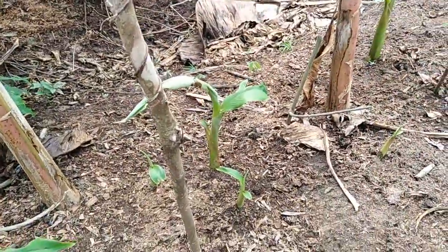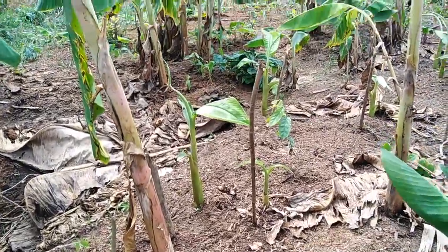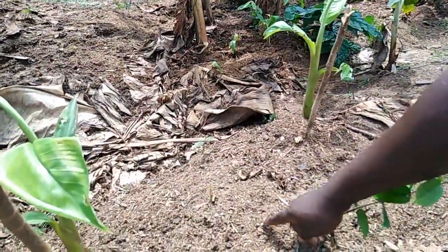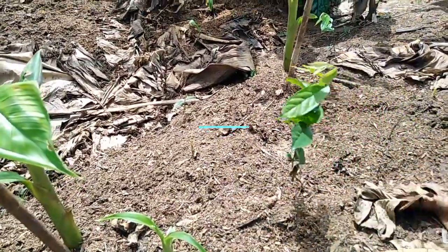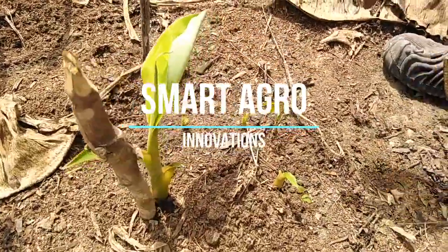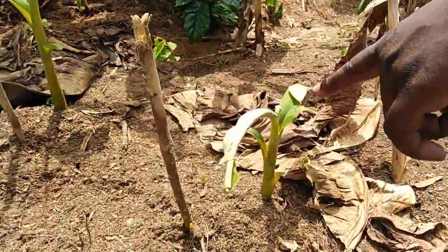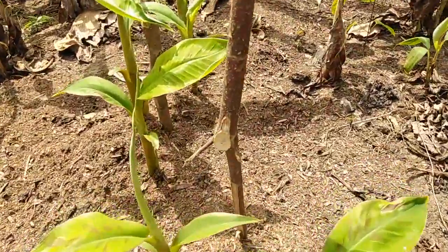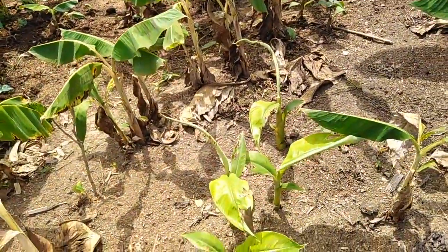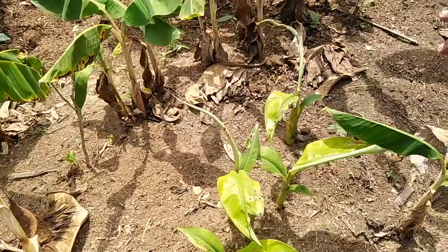Here too we have three, and still counting. This one still has only one seedling coming up. You have two here. Here too we have three — one, two, three — coming up. There's another one here, so that means we have four over there. One, two, three, four rising here too. We have three. We have all the counts over there, and usually we do a comparison of the height. After the whole thing we shall compare the height and the diameter, and record which gives the highest number.